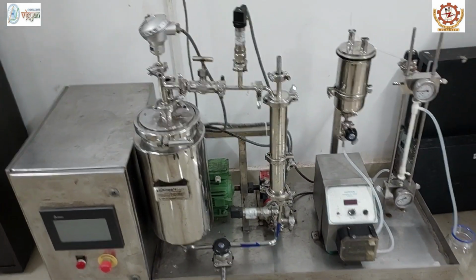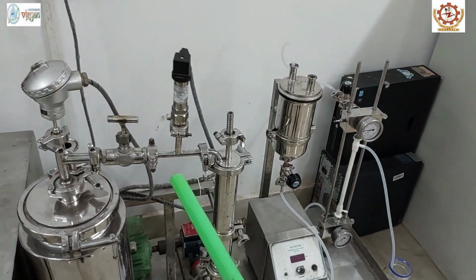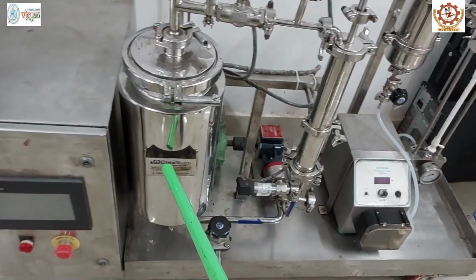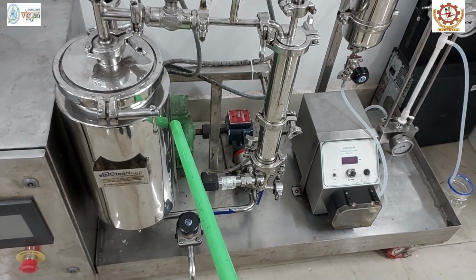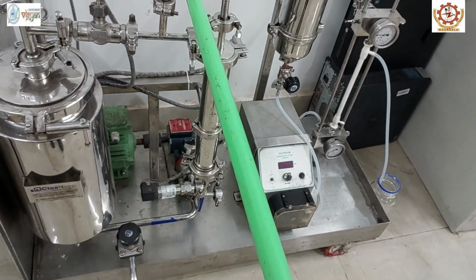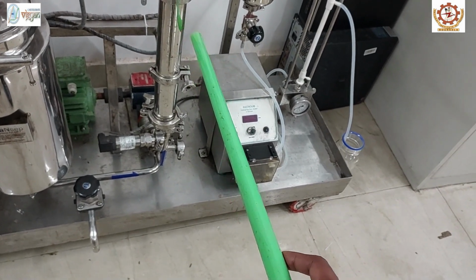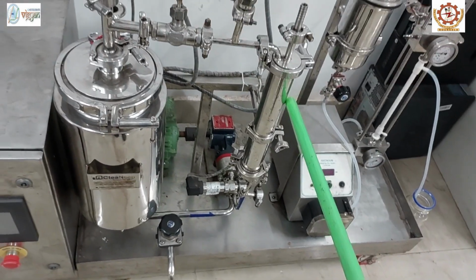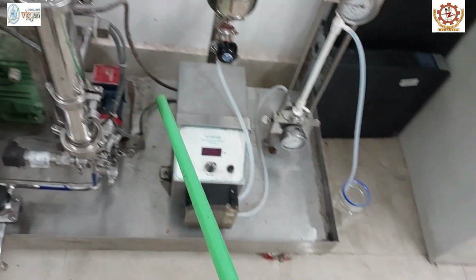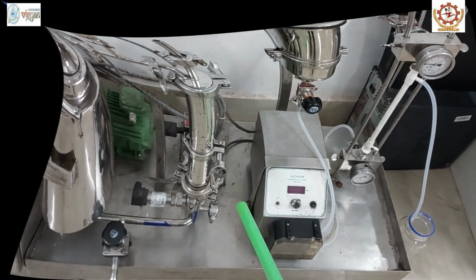The different parts of the membrane concentration unit include one pressure control valve, one feed tank where we will keep our feed, then two pressure gauges, pressure gauge 1 and 2, and a membrane module. Here we will keep our RO or nanofiltration membranes. Then a peristaltic pump here, similar to our microfiltration unit. We also have a peristaltic pump in the concentration unit.